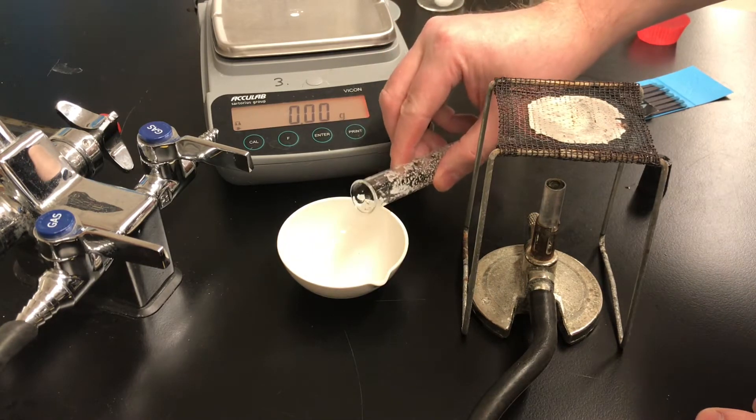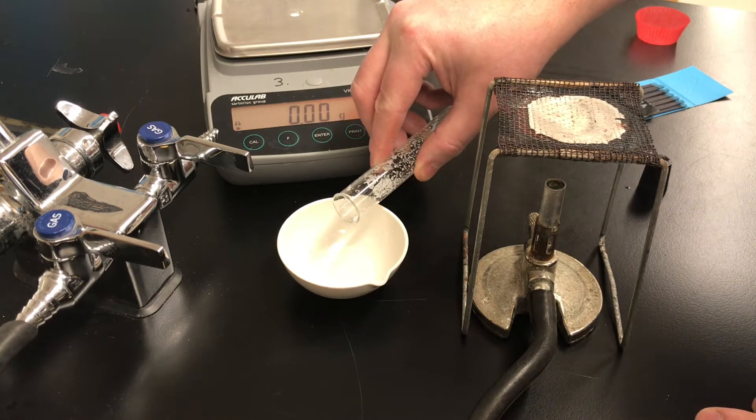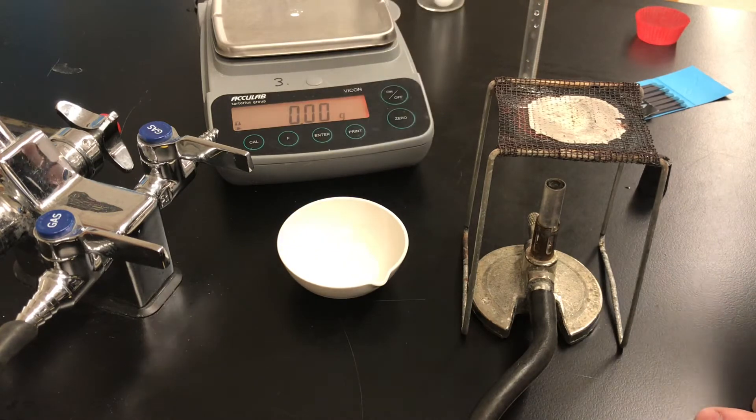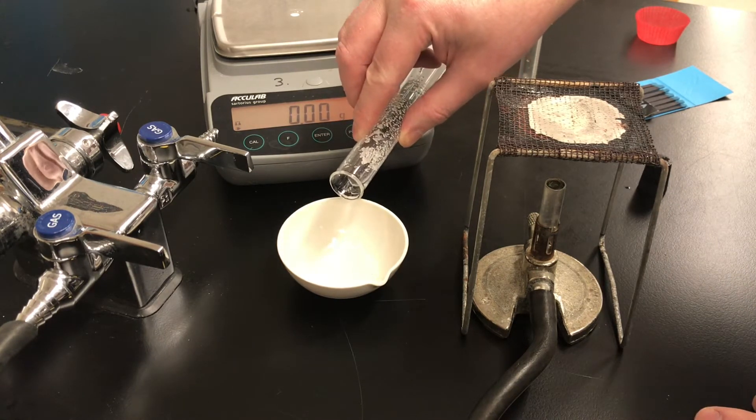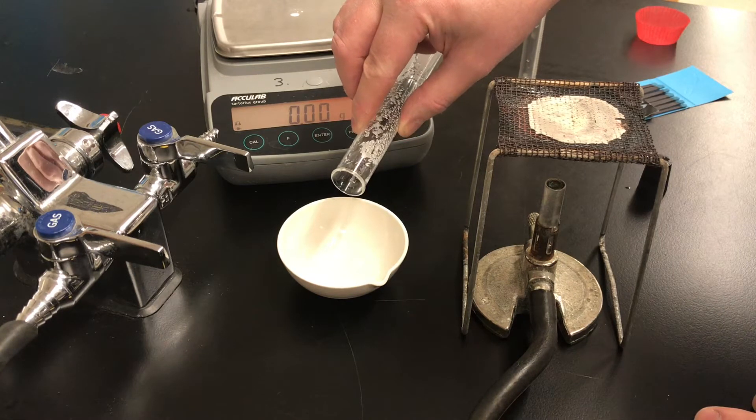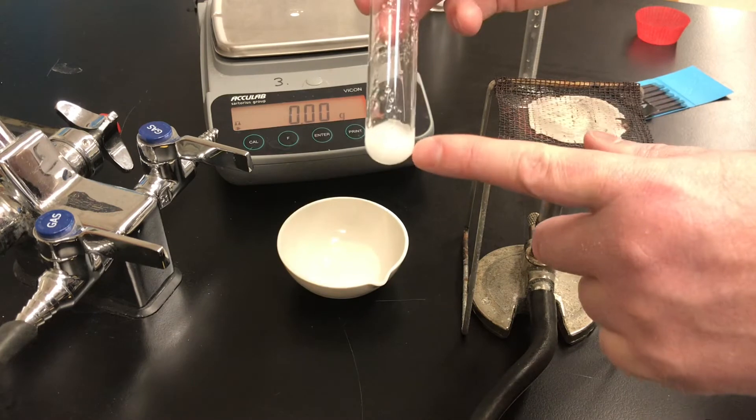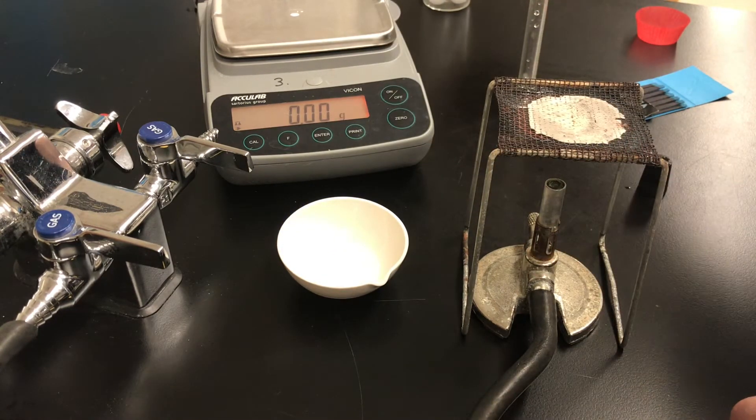Let's decant the saturated solution into the evaporating dish. You don't have to get it all out but you do need to get as much out as you can. The more you get the better but you don't want any undissolved salt to get in the dish. So there's a little bit of liquid left behind. That's okay.